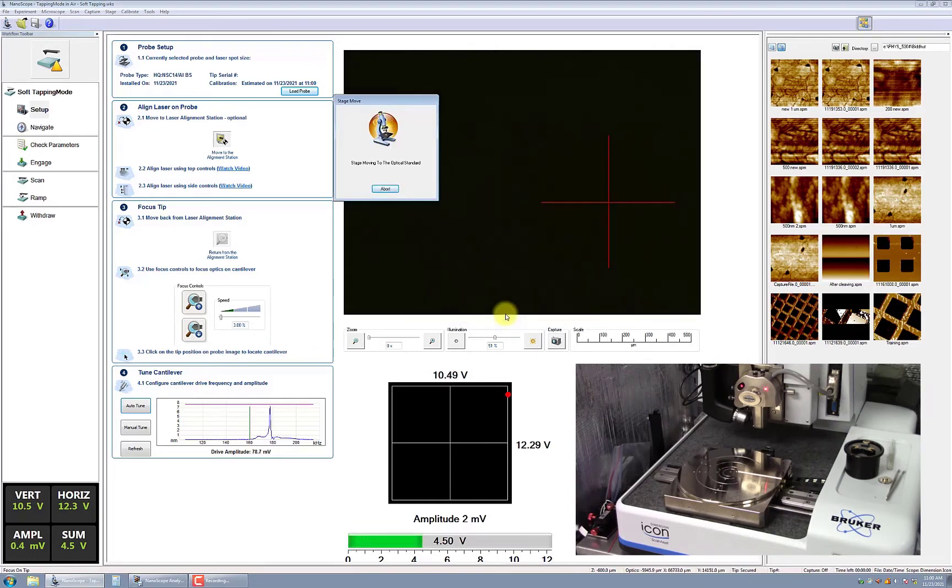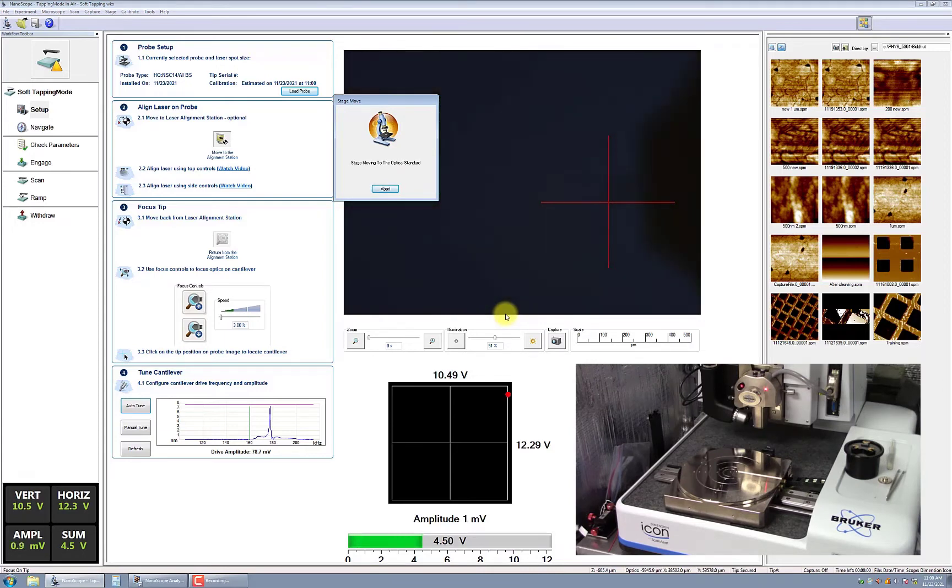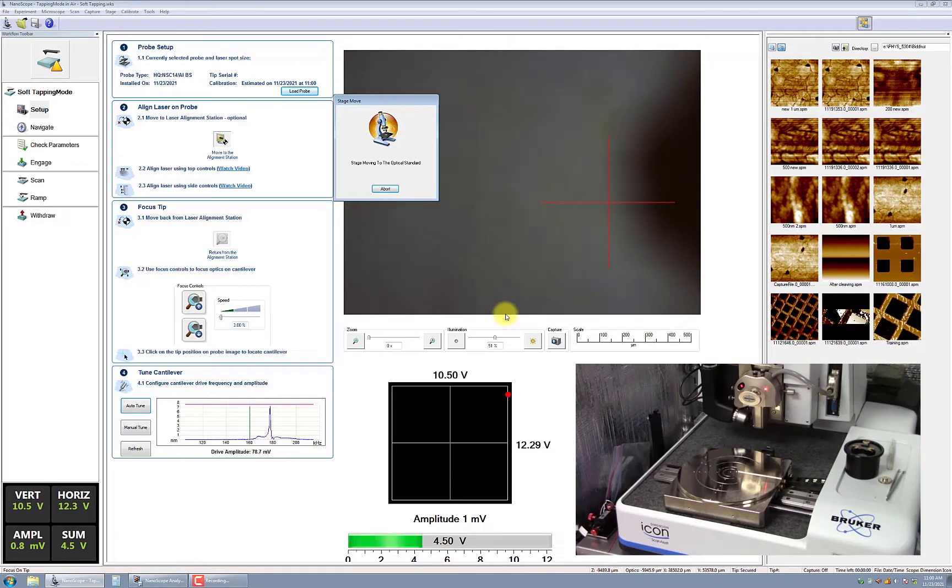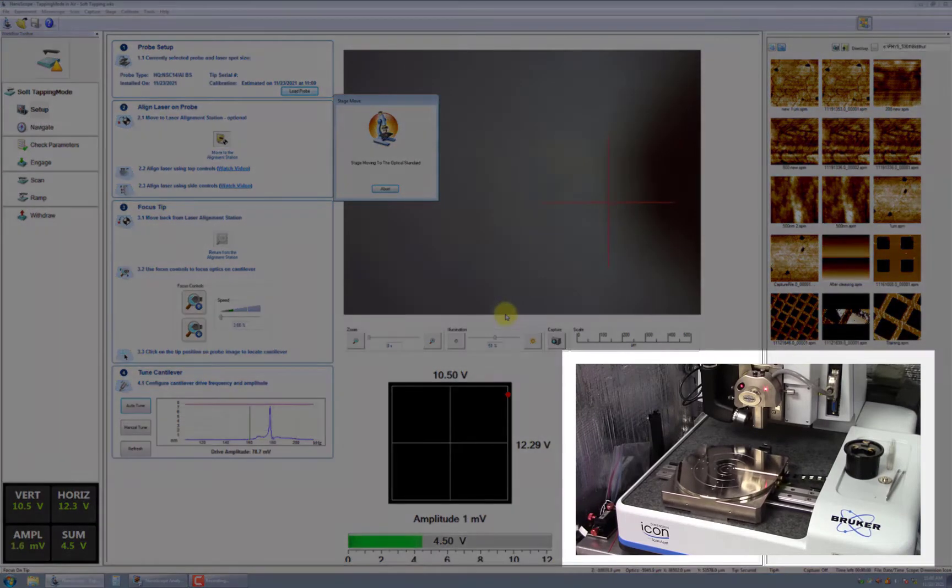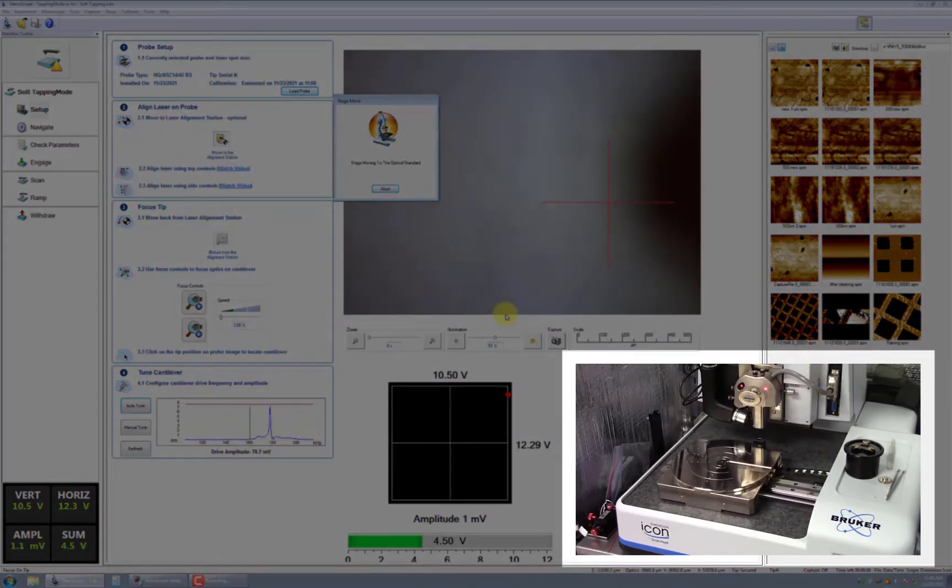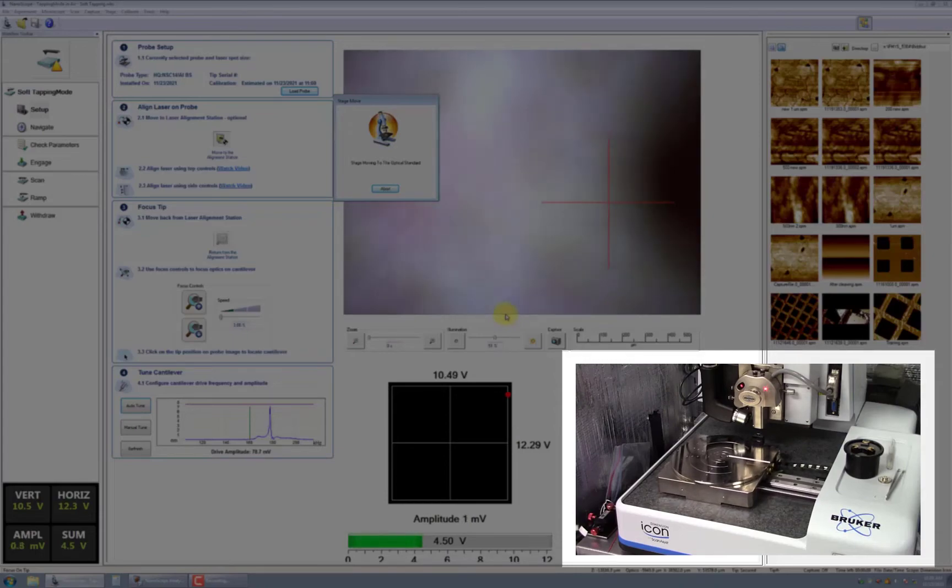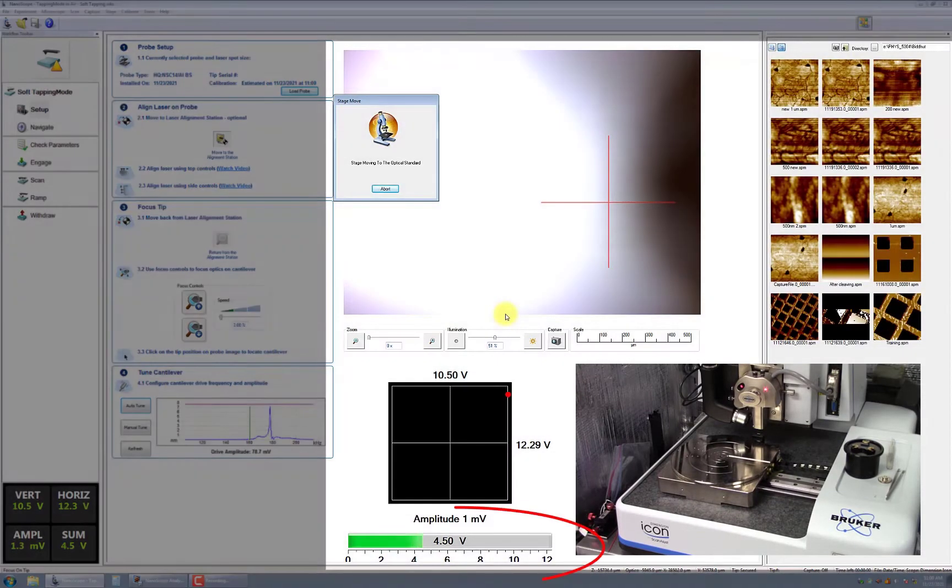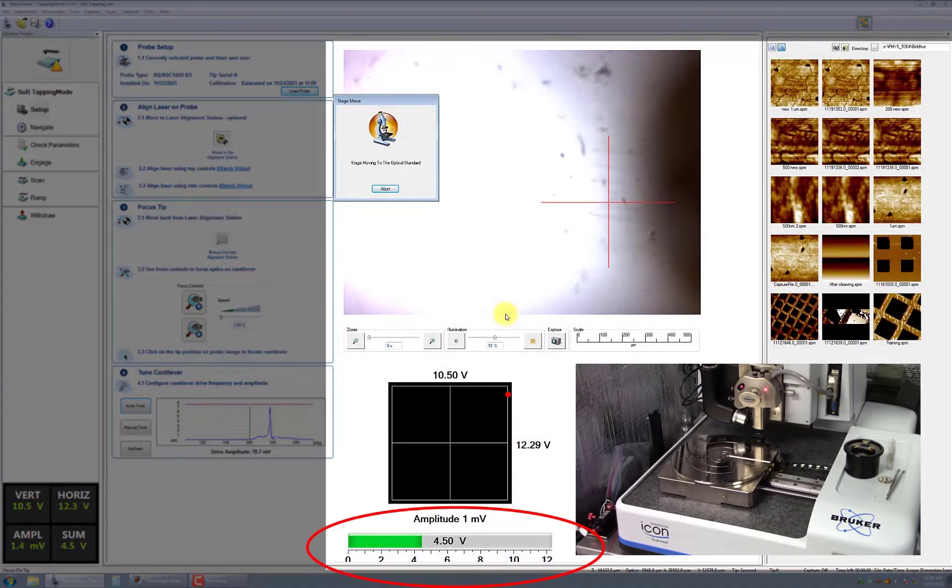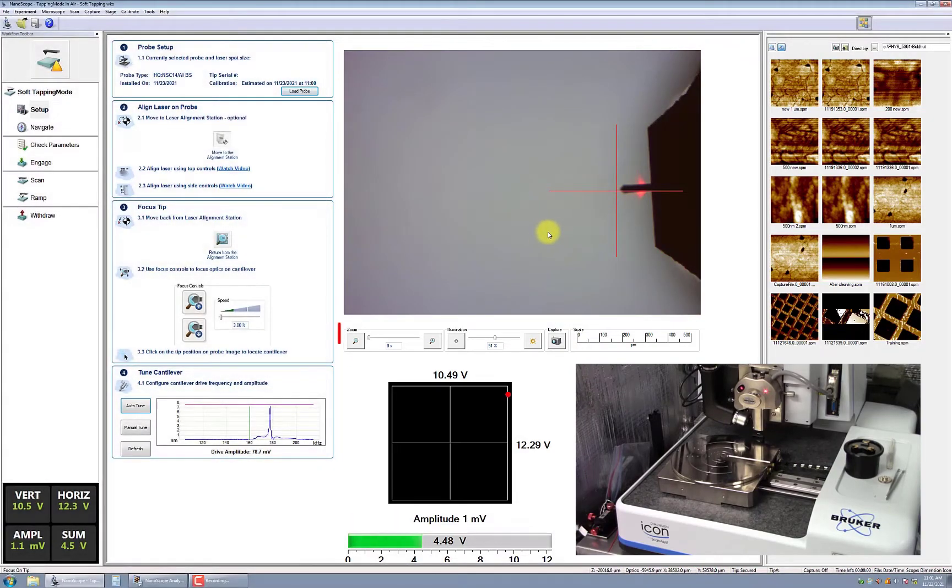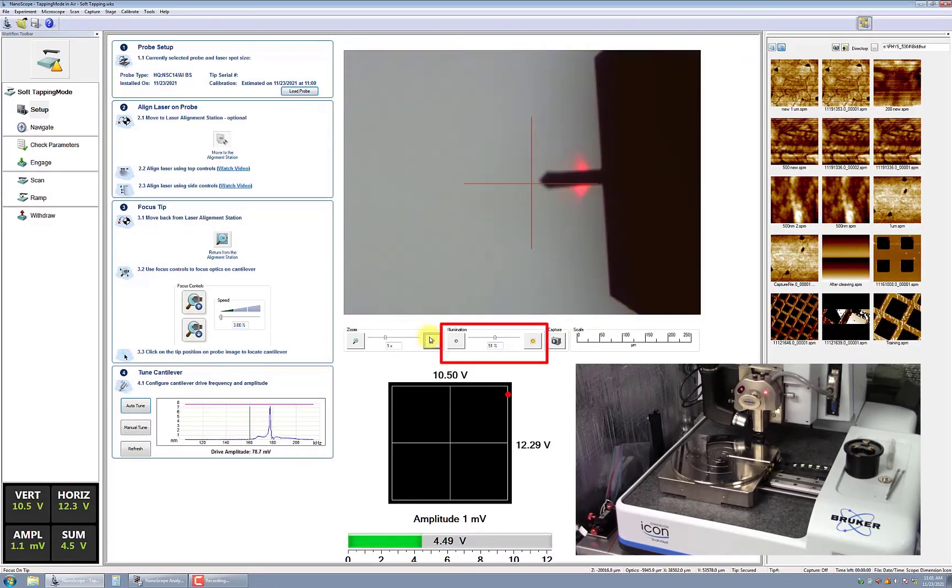In some advanced techniques, there are specialty probe holders that are not suitable for use in the alignment station. The application notes for these techniques will specifically highlight to users if you cannot use the alignment station. After clicking Yes, you will notice that the mirrored alignment station is moved directly under the scan head. Position the cross close to the tip. This is important because the cross determines the origin when you zoom in. You can zoom in 1x or 2x and adjust the illumination as needed.